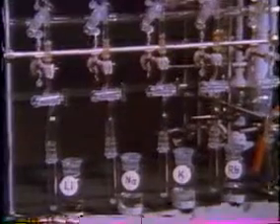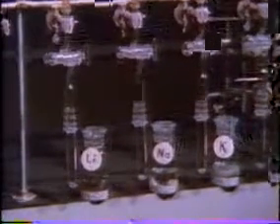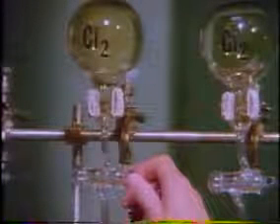Potassium reacted with chlorine. Do the other members of this possible family also react? The gas bulbs are now filled with chlorine, and pieces of the 5 metals are in the reaction tubes. Here are chlorine and lithium.